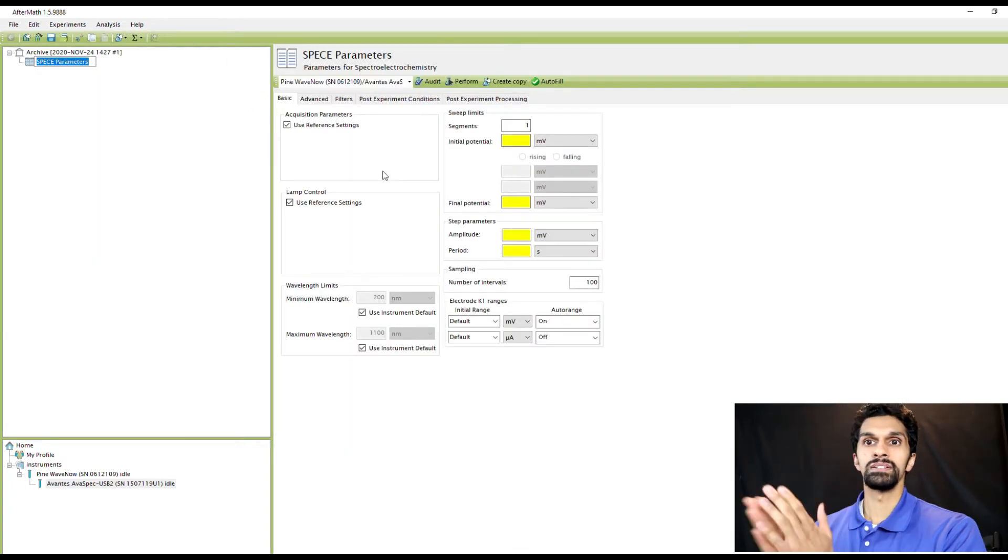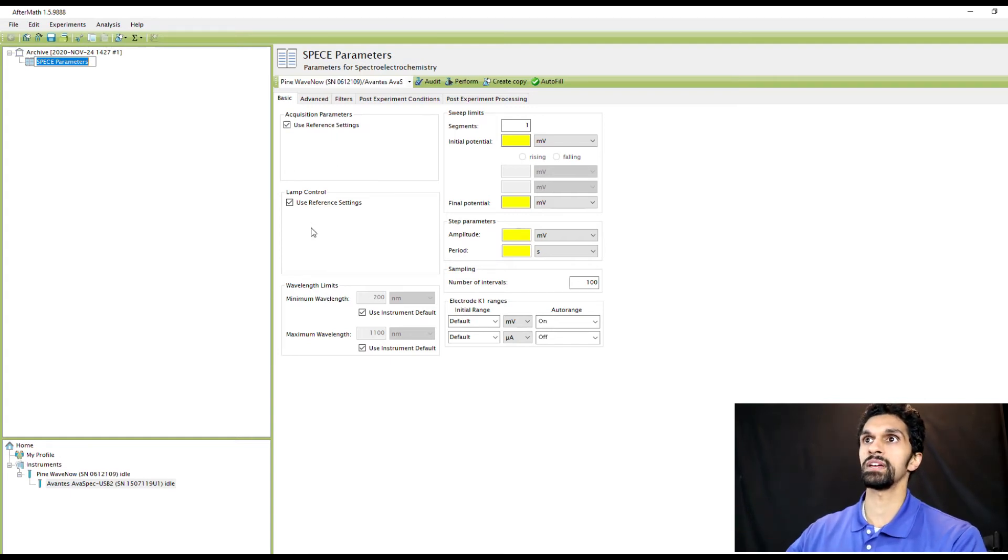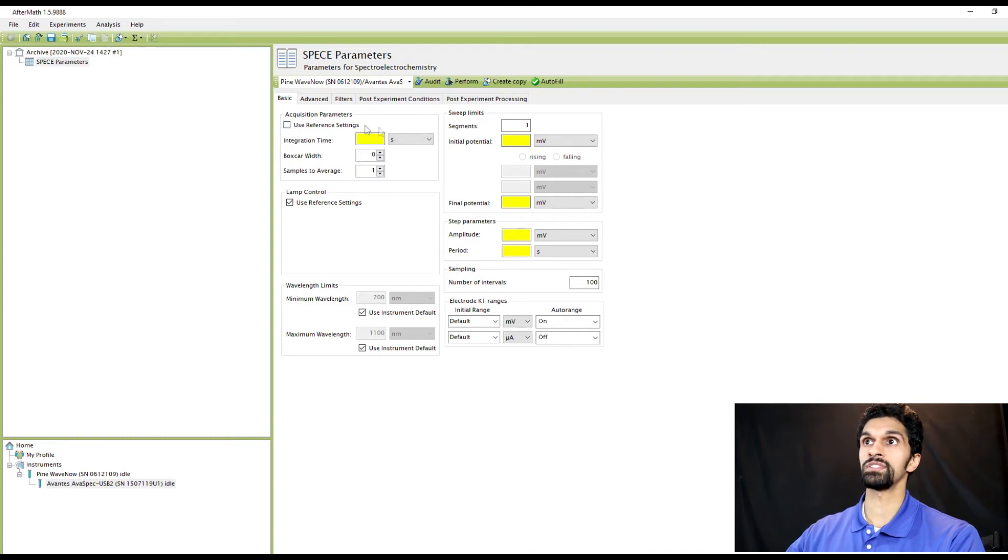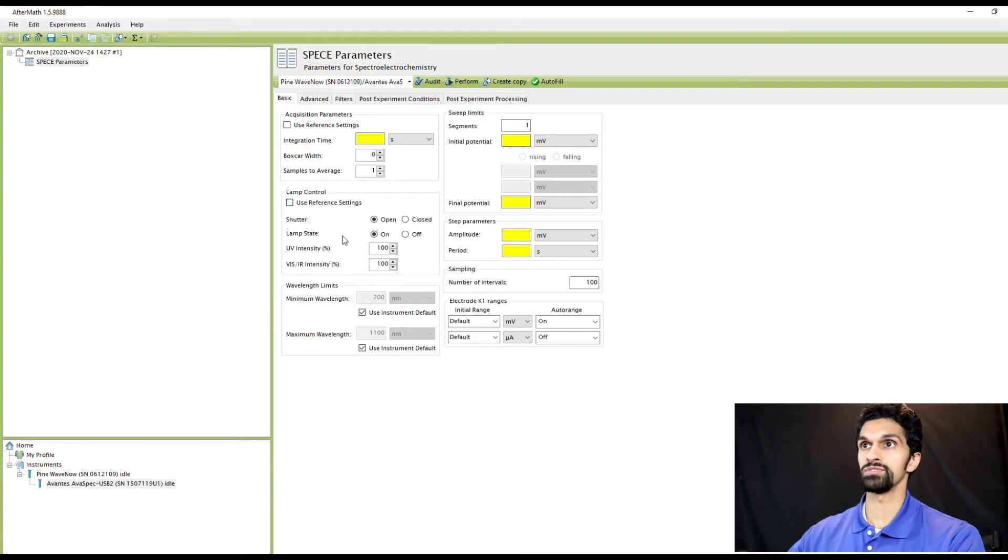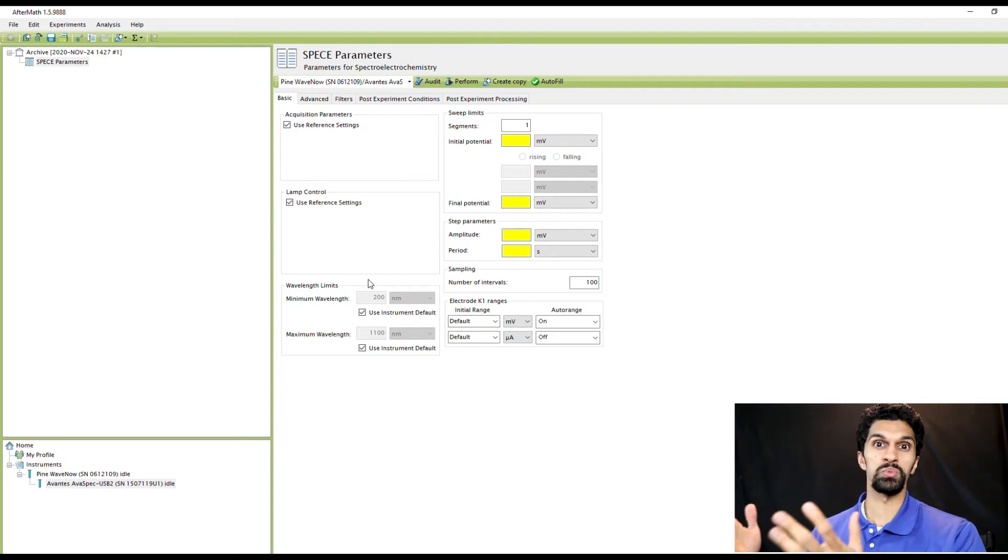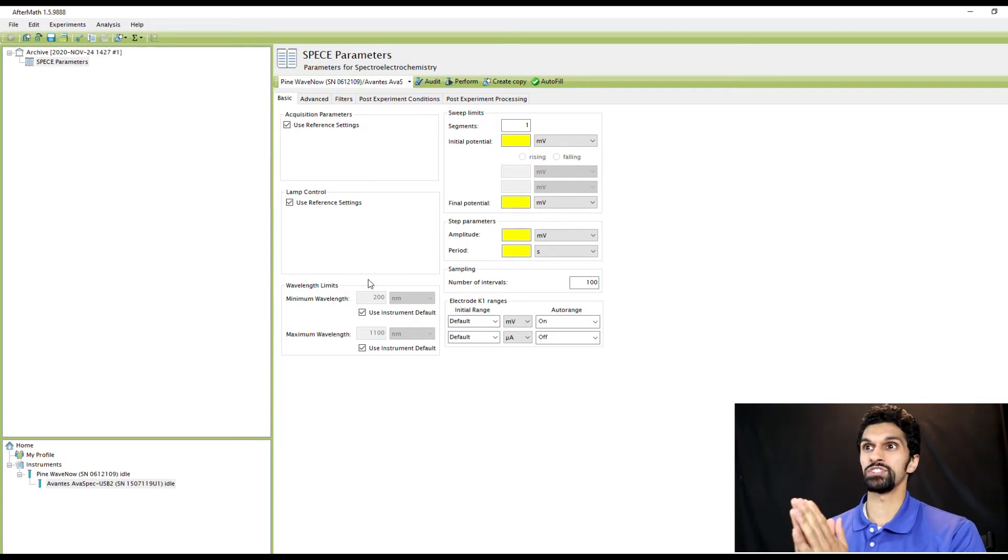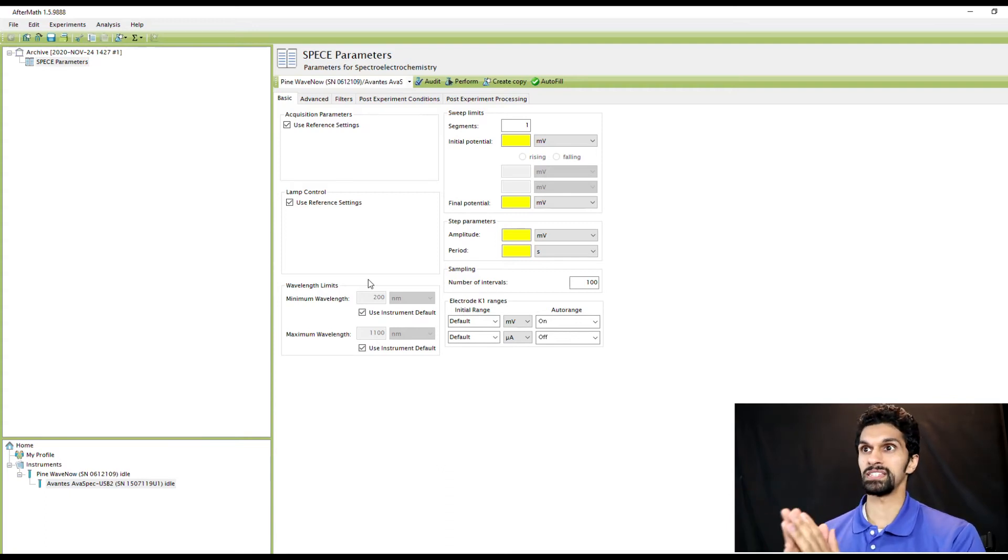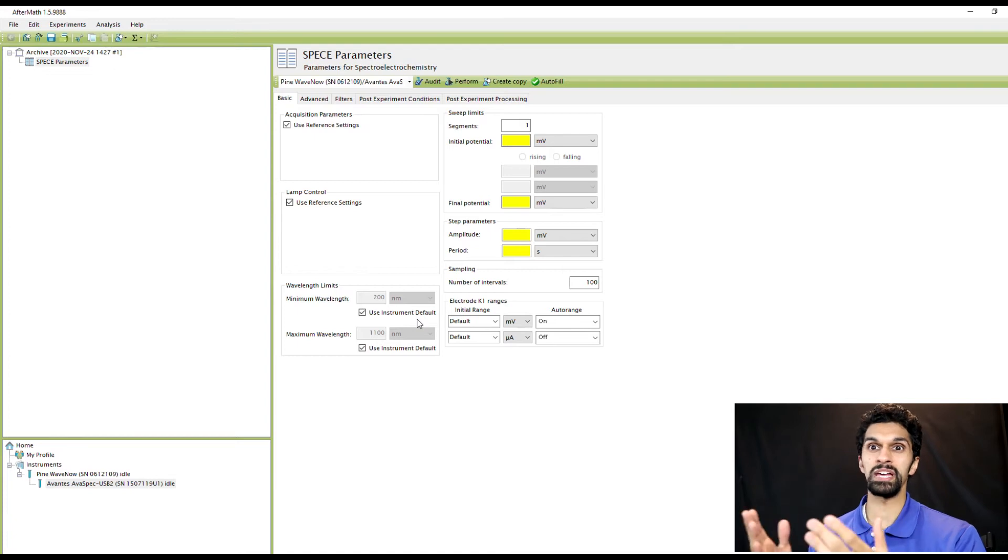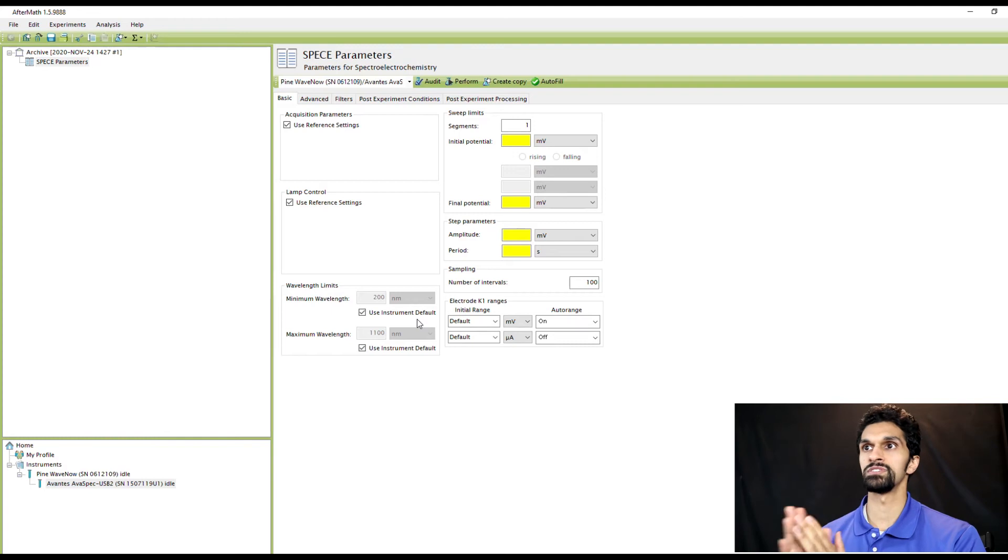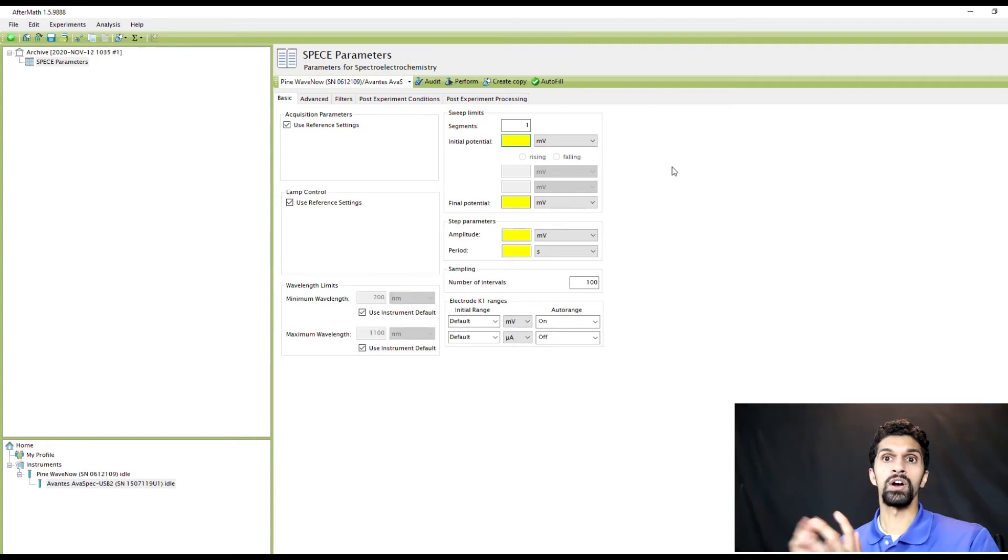The spectrometer controls that I showed you before, the acquisition parameters and lamp control, are all over here. I'm just going to use the reference settings, but if you want to you can change them. You uncheck this and then change the reference settings or uncheck the lamp control and change the lamp control. Next I'm going to go over the wavelength limits. The wavelength limits are actually just what is displayed after you've collected the spectrum. The spectrometer will always collect the maximum range allowed, 200 to 1100 nanometers, but if you only want certain spectra to be displayed within a specific range like the visible 400 to 700 nanometers, you can uncheck the instrument defaults and manually type in what limits you want selected.